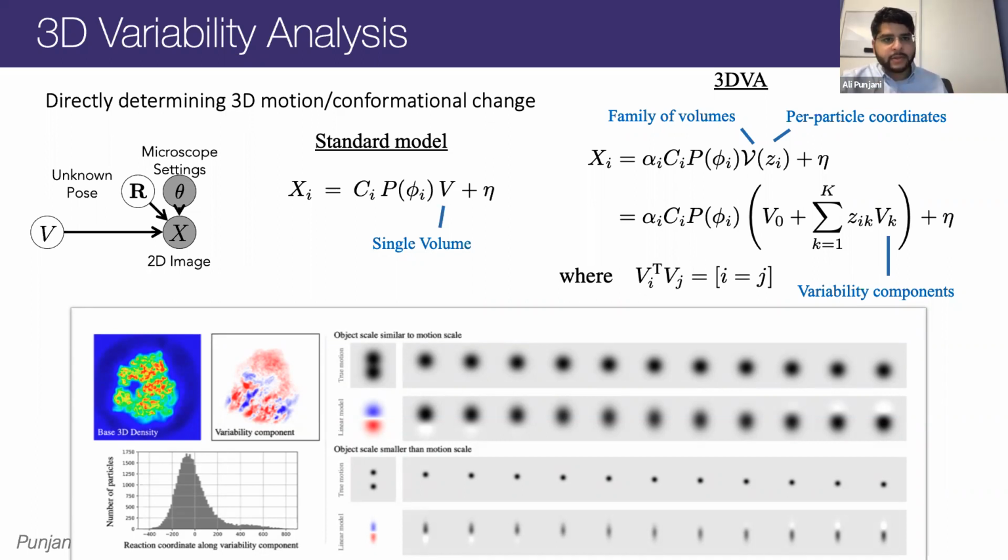From that information, you can manually create masks around regions that you think are rigid based on the 3D variability results, which were totally unbiased and only data driven. And then those masks will help you get higher resolution structures of parts that are in fact somewhat rigid. Of course, in real proteins, motion is never fully rigid. If the protein is bending, it's not bending around a perfect hinge joint. And so the notion that we're dealing with rigid objects is false. But it's still a worthwhile approximation.